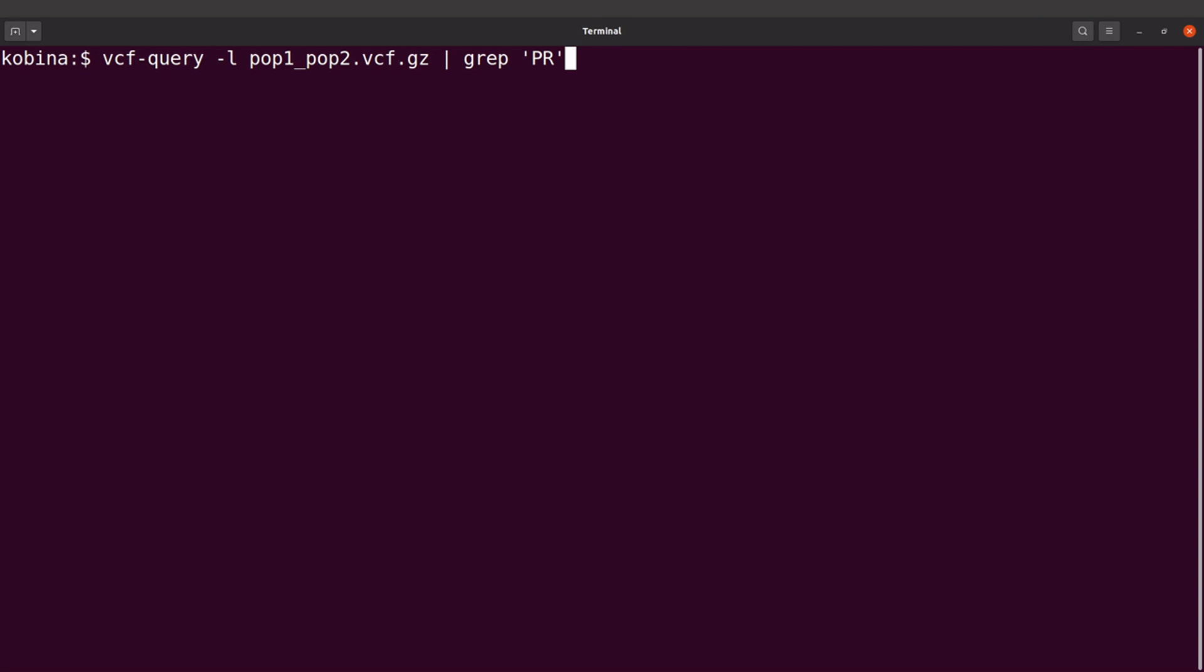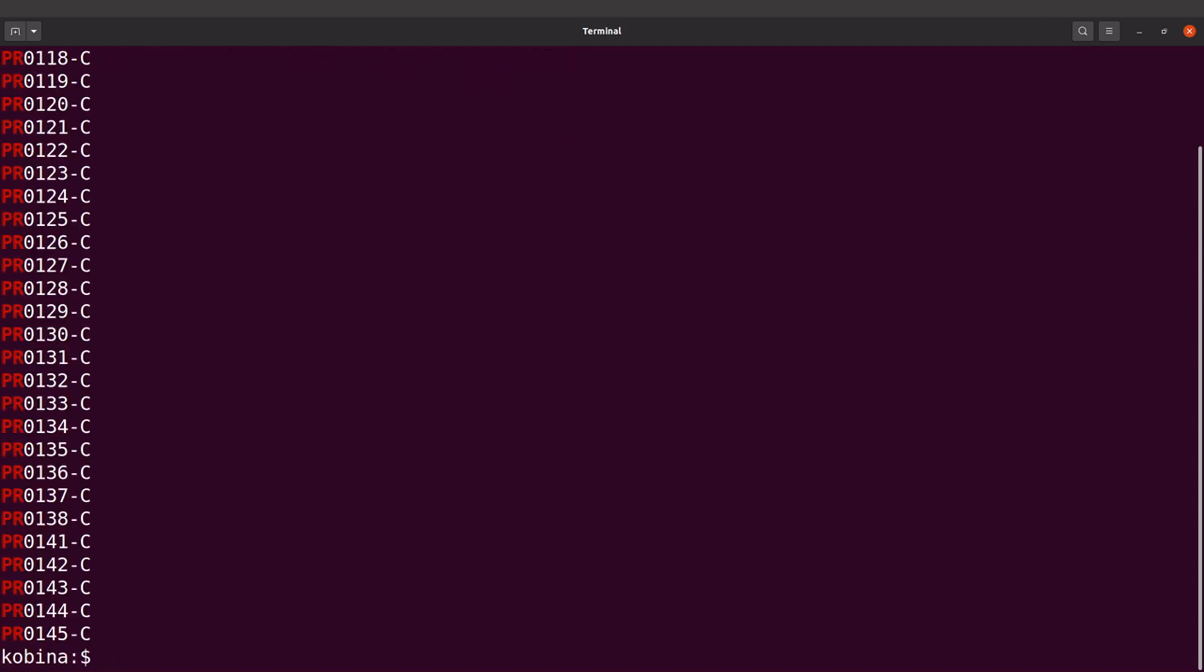So let's do this. Let's just look at how this can be done. So this is a sample command. So let's run this. Perfect. So you can see only the sample names beginning with PR have been displayed here. So that's it.